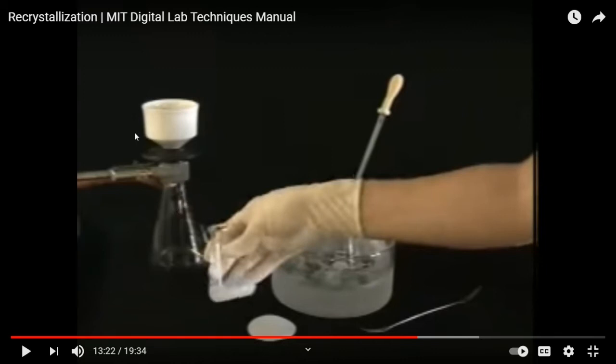And also, because we have to do it later, many of them, I'll tell you one thing about this vacuum filtration. Vacuum filtration is causing a vacuum underneath. When it's a vacuum, the boiling point of the liquid down here gets lowered. Okay, so evaporation is gonna take place, meaning it's mini boiling going on. You're losing solvent. So whenever you have a mixture where you keep liquid as your final product, you don't want vacuum filtration because, with the reason I just explained, you're going to lose your product.